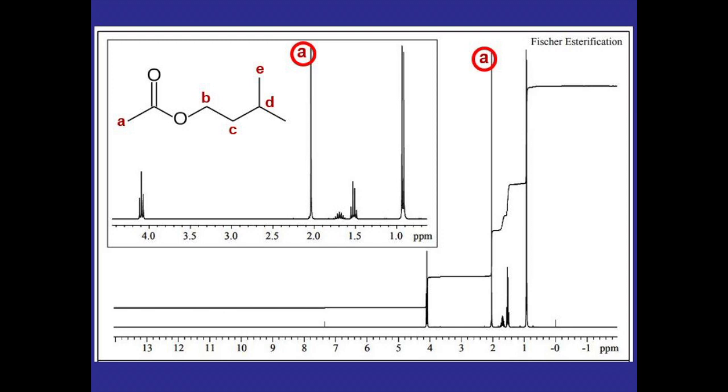Now we can start analyzing the rest of the peaks. For example, this one shows up around four ppm's, being in the range for this kind of proton which usually ends up between three and five ppm's, so that would be for hydrogen B.